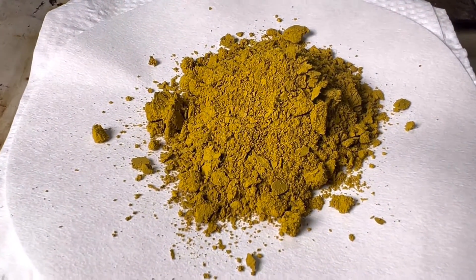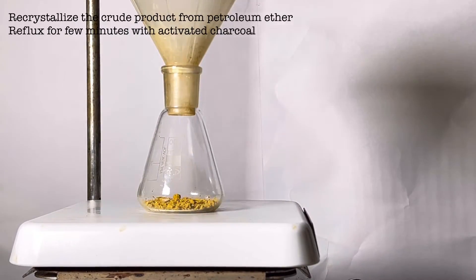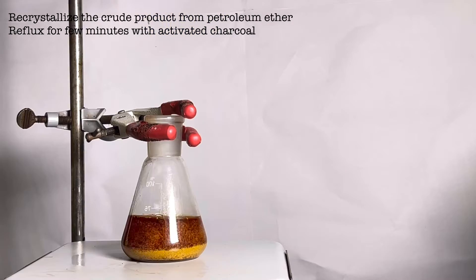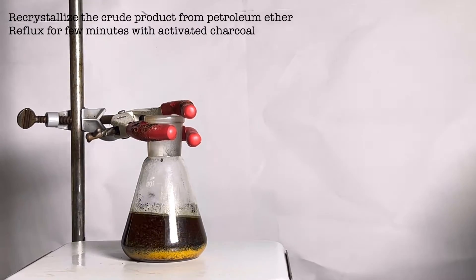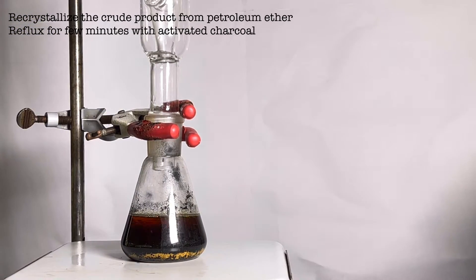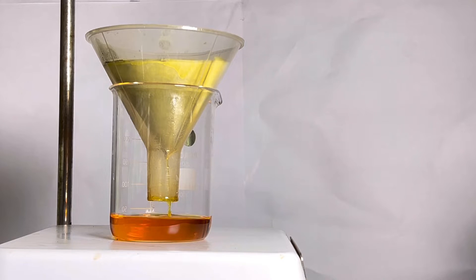Now it is time to recrystallize and purify the product. Petroleum ether is the solvent used in this case. The mixture was boiled with reflux for 15 minutes with activated charcoal to remove the colored impurities. After 15 minutes the solution was filtered using a normal gravity filtration method. The filtrate was placed in the fridge overnight.